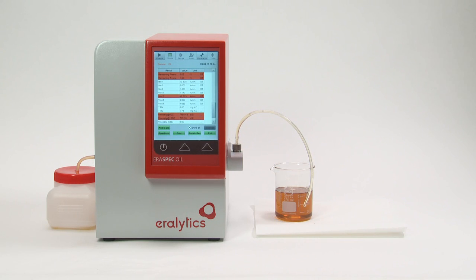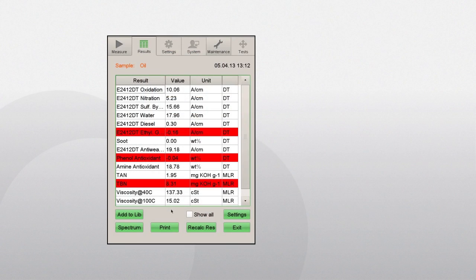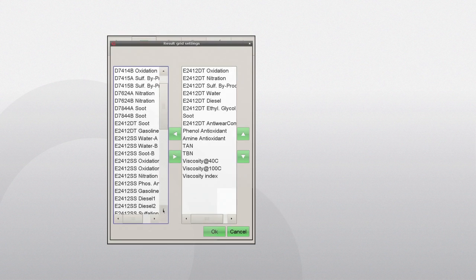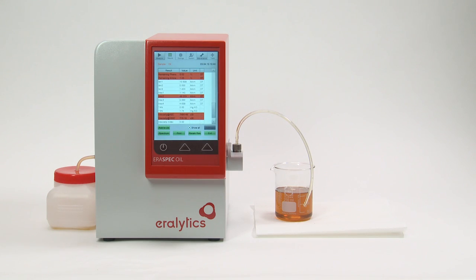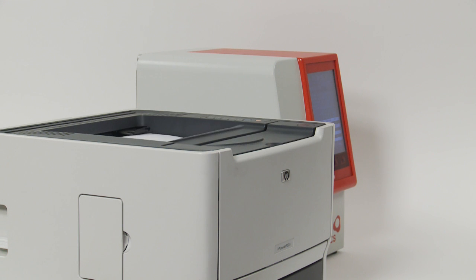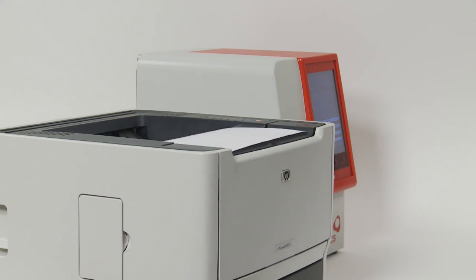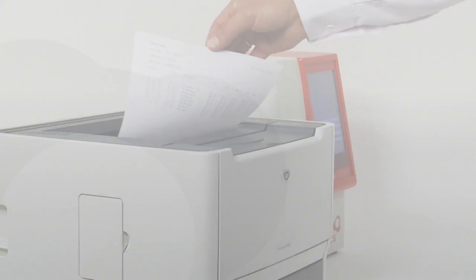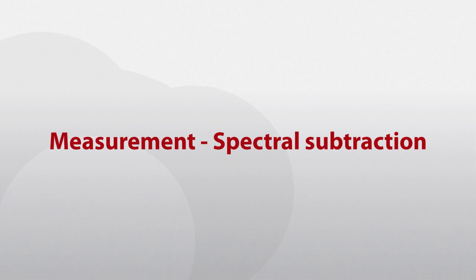Click Settings to append the list with additional parameters. The results can also be printed on a directly connected printer or via Ethernet connection to a LAN or network printer.